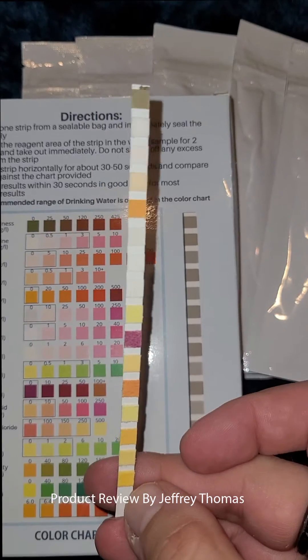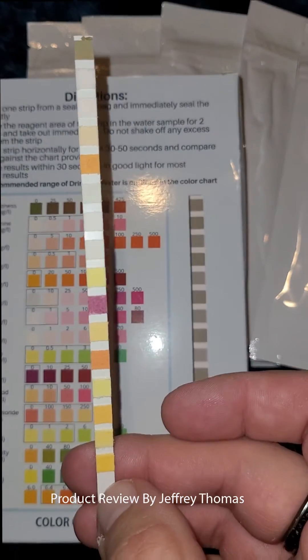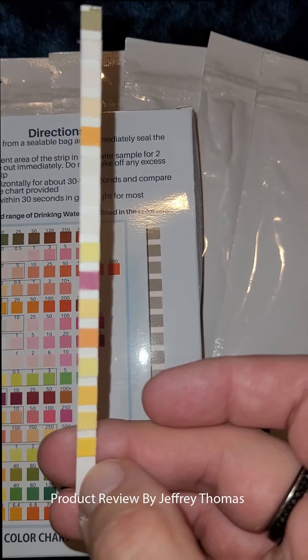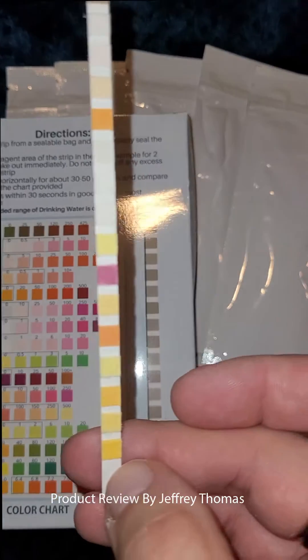When you pull the strips out of the package, you want to hold them down at the very bottom. You don't want to touch any of the test pads because oil on your fingers can give a false reading, cause bad coloring, or make the strip ineffective altogether.